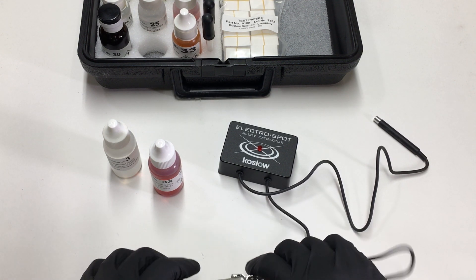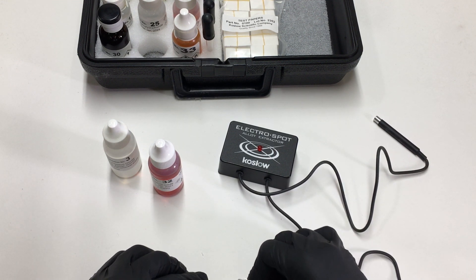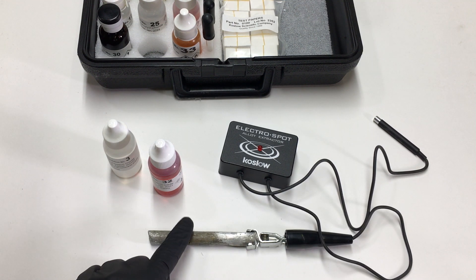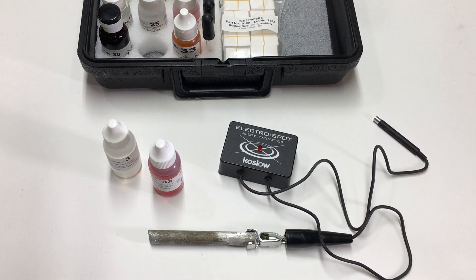Attach the alligator clip to the metal. I want to find out if this metal contains cadmium.